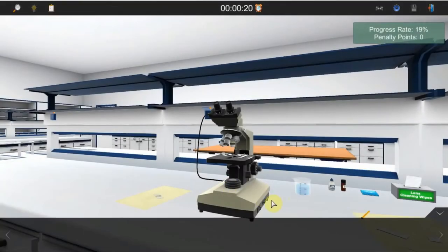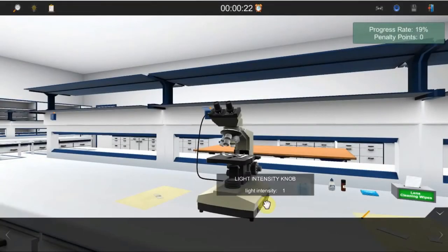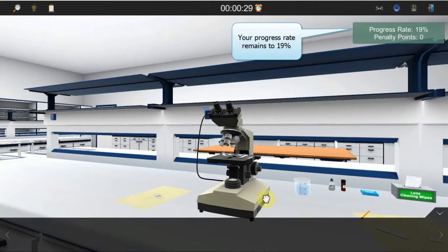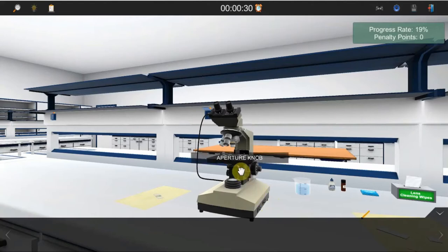Let's see what happens if you don't execute a step of the experiment correctly. The light intensity is set only to 12. The progress rate remains at 19 and a penalty point will be added at a later point.